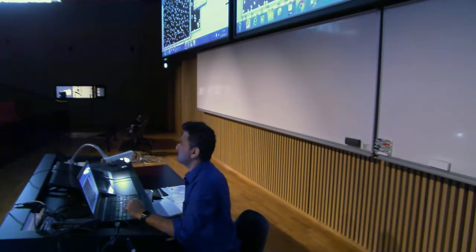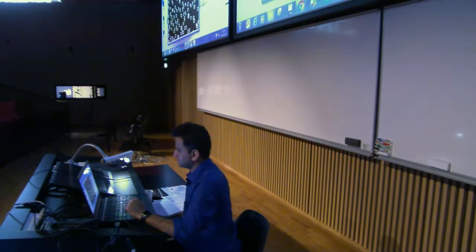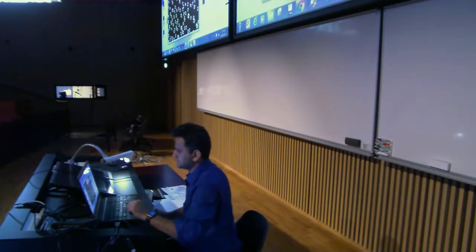Yeah. Can you show again, please, how you use the ROI from the analysis? Okay, let's go back. So until this point is okay. I close the ROI manager now, everything is closed, discard.